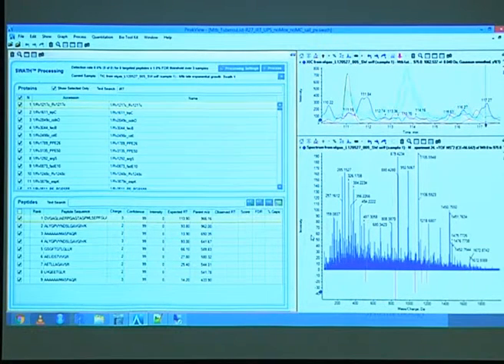Once you've loaded everything and specified everything, you get a pane here with the proteins that are stored in your library. Here's a pane with the peptides that are in there. This one shows you the traces that you've got. And this one is the actually acquired MS2 spectrum at where that blue arrow is. And this is, if there is a nice looking peak group, the apex of the peak group.